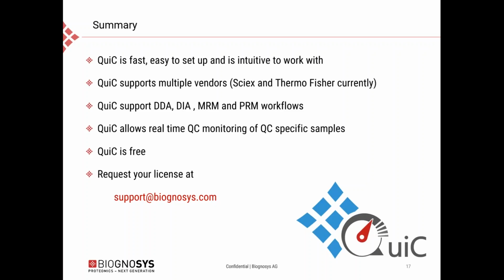And we also perform quality control in every individual quantitative run, because we have the IRT peptides spiked into every run. So we perform a sort of 3-tier quality control, which provides us with very robust instrument performance, the performance we'd like to have. And we are also quick to intervene if something is not going correctly in a measurement.